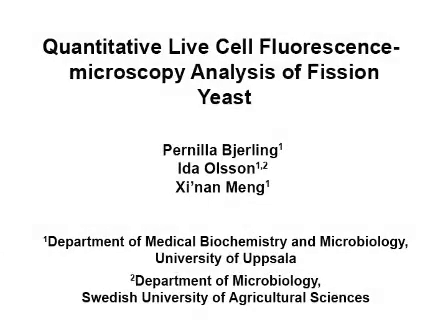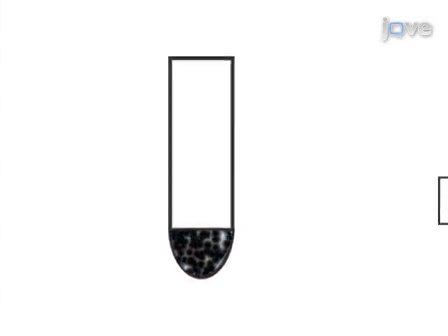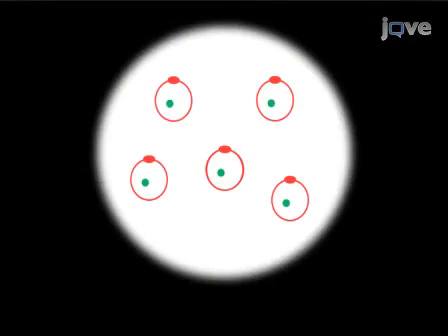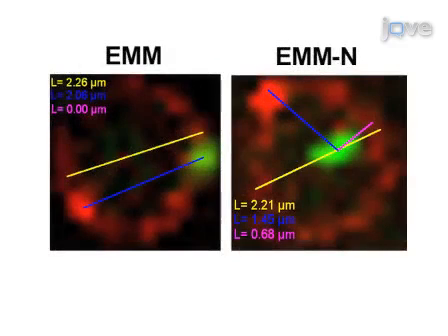The overall goal of the following experiment is to quantitatively measure the subnuclear organisation in yeast cells and how it is affected by changes in growth conditions or mutations. This is achieved by growing yeast cells to log phase in conditions that will minimise autofluorescence. Next, the cells are placed into a growth chamber for viewing under the microscope. Then, images are taken to measure the distance between different fluorescently labelled structures in the cell. Results are obtained that show differences in subnuclear organisation, which is dependent on changing the nutritional conditions during growth of the yeast culture.